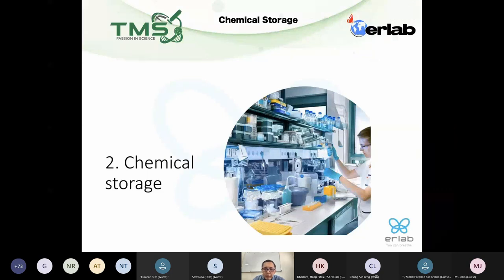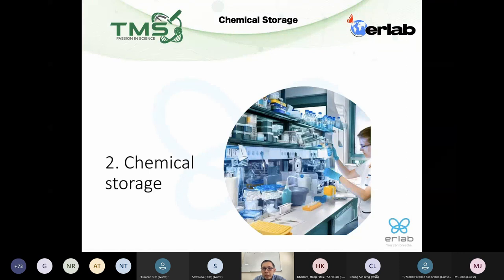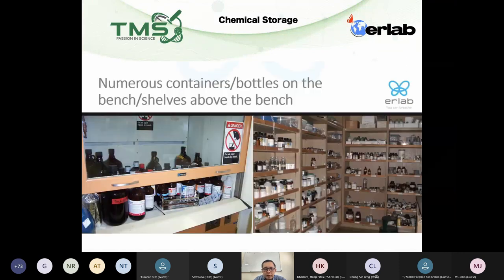Let's go into the next topic: chemical storage. In this slide, I will talk about how to segregate chemicals. I hope this will give you some input when you want to plan your inventory and how to store your chemicals.